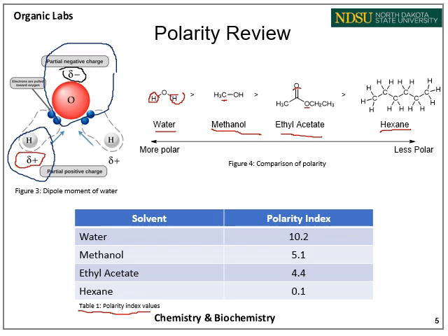These values are determined through experimentation. However, if you ever get confused on polarity, you can always just look up some of the values. But it is nice to be able to reason your way through what is a polar molecule versus what is a nonpolar molecule.